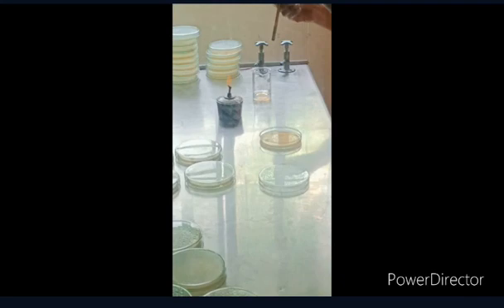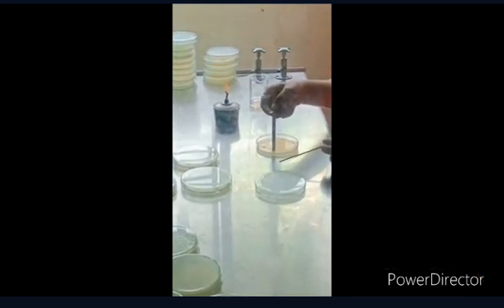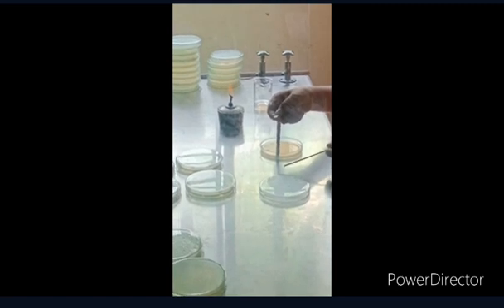At first, you need to make small wells on the agar plate with the help of a sterilized cork borer. Don't forget to re-sterilize the cork borer after making each well. You can sterilize the cork borer by dipping it in alcohol and running it through an open flame.